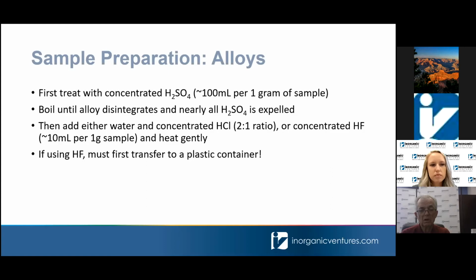After the sulfuric has been expelled, you can either dilute that with concentrated hydrochloric acid or concentrated hydrofluoric acid and heat that gently to complete the reaction. I do want to point out, if you are using hydrofluoric acid, to make sure that you're using a plastic container, as HF is going to be caustic to any type of glass that you may be using.